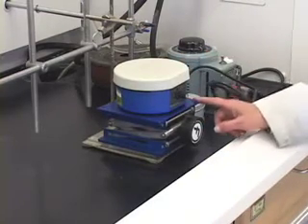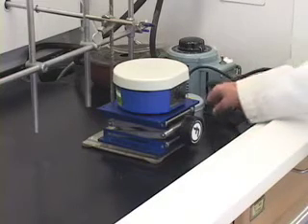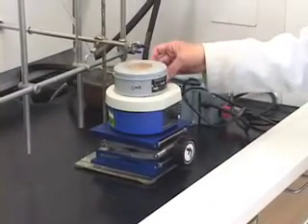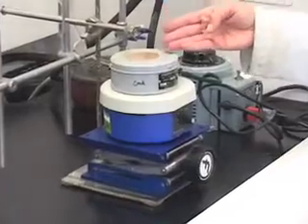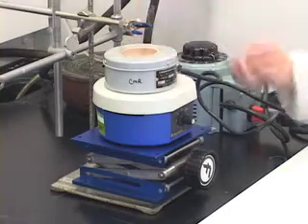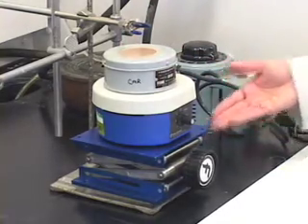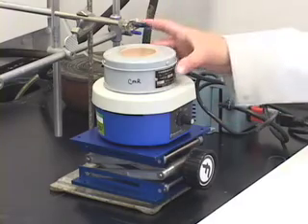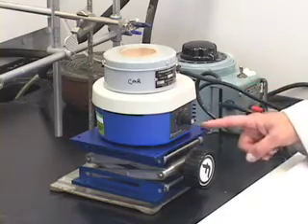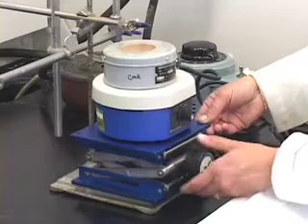Why do I need a jack below the stirrer? In distillation, remember we are going to heat the liquid using the heating mantle. This we already preheated and now it is cooled, because you do not want to set up anything when the heating mantle is hot. This is the way you are going to start the setup — you have the jack, the magnetic stirrer, and the heating mantle.